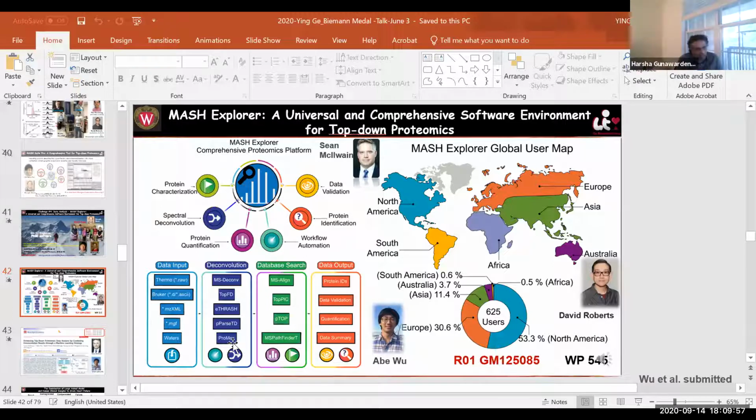Can these algorithms handle ion mobility data? Can you get ion mobility resolved deconvolution of your data? We continue to add those features, right? So right now, since we got a Bruker timsTOF, we have to modify the software to upgrade it to handle the ion mobility data. So again, if you can try the MASH, as a user you can give us suggestions to improve, right? We still have 2 years of funding, so it's a good time for you to raise any needs you want.